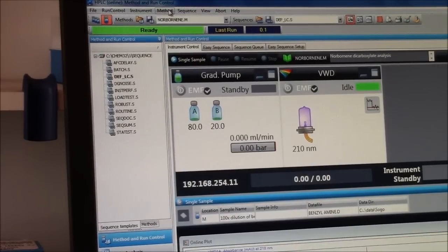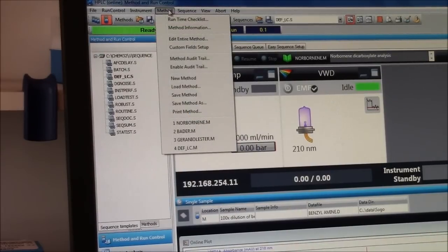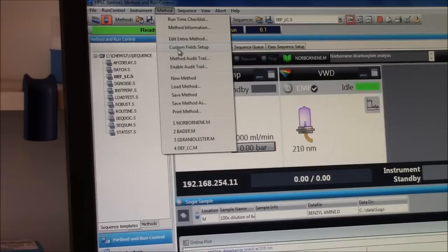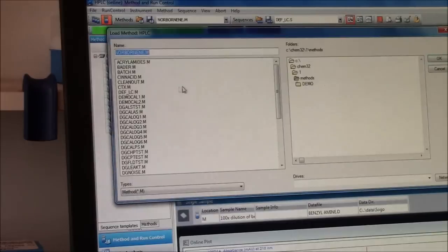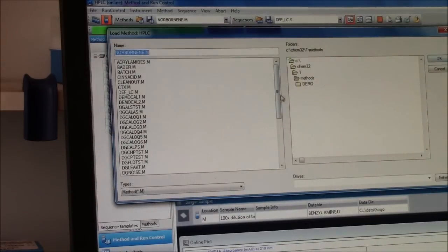Now I need to look at my method. Often you will load a pre-existing method. Load method. I can choose from all these. The one I want is Norbornine.